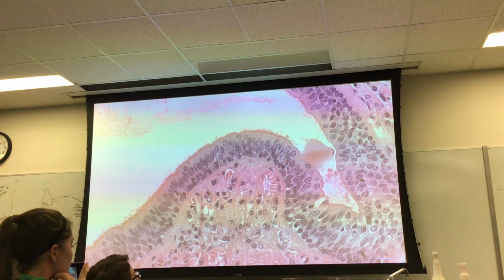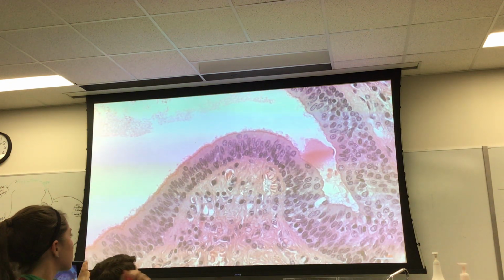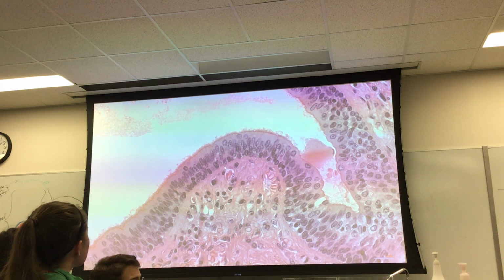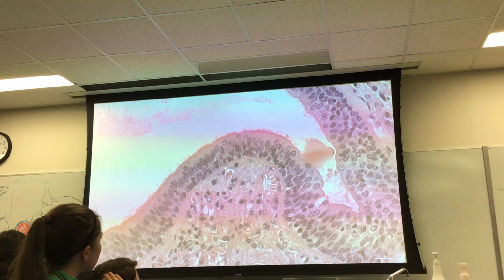Okay, here's your next one. So, here's the tissue from here to here. What is it? Where is it? Is it stratified?